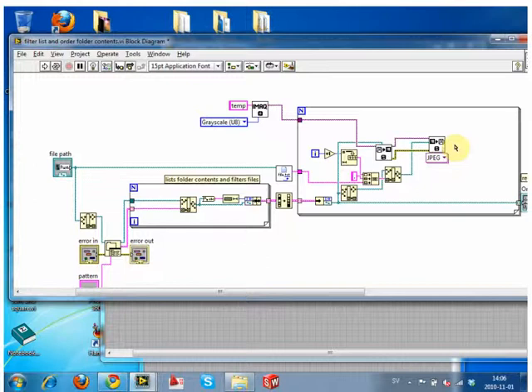There's probably a file rename function, but I would generally stay away from it because if it screws up, in other words, your program isn't 100% perfect, you're going to screw up all your files. You're much better remaking the file and screwing up, because the worst that happens then is your output file is wrong. You did something wrong, it doesn't work. You haven't actually destroyed the files that you're using. If you have file renaming things, there's a chance that you might just destroy the file. Just like in any programming language, you can do really bad things. And LabVIEW is exactly the same. You can corrupt a file if you do something wrong to it.